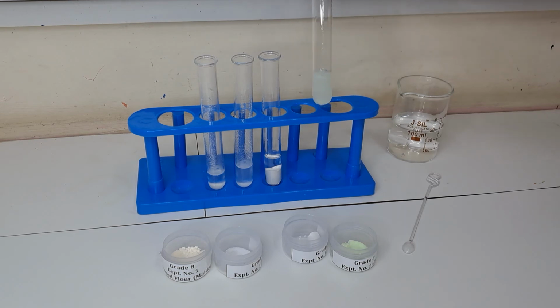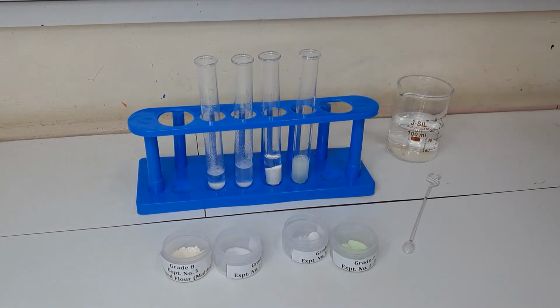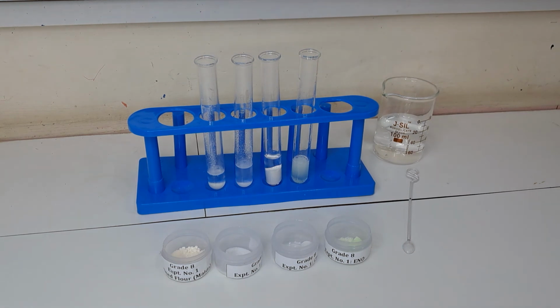Write down your observation. Observation means the things which you can see, those which are visible. And the conclusion means the reason behind it. For example, in chalk, if the bubbles are there, and in ENO also the bubbles are appearing, so why are the bubbles there? That reason is nothing but the conclusion.